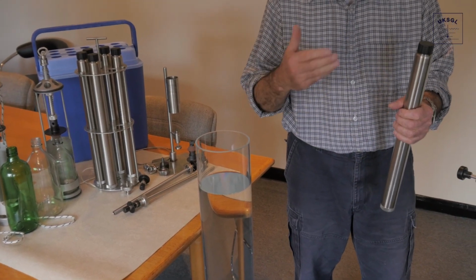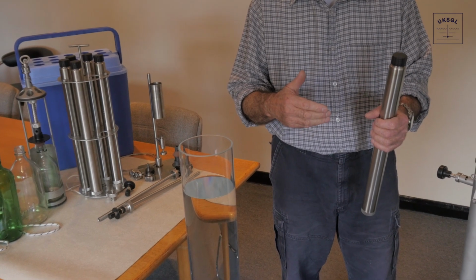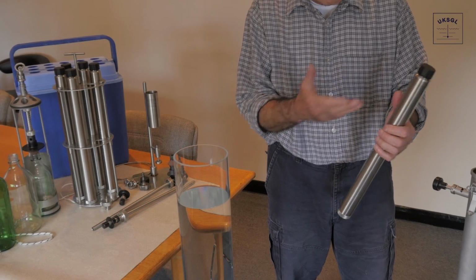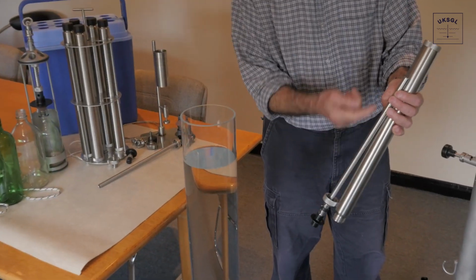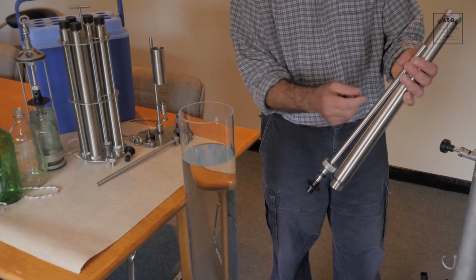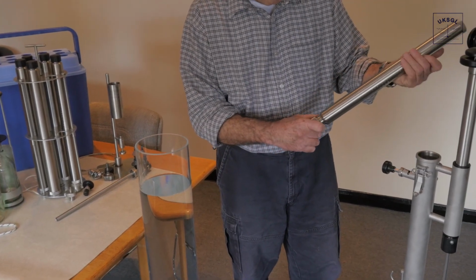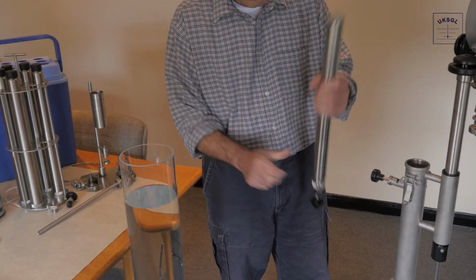How do we know that the tube holds approximately 80% of the volume of the sample, which is a requirement of the regulations? The probe inlet pipe reaches 3/4 of the length of the outer tube, so the liquid should be just above the pipe end.